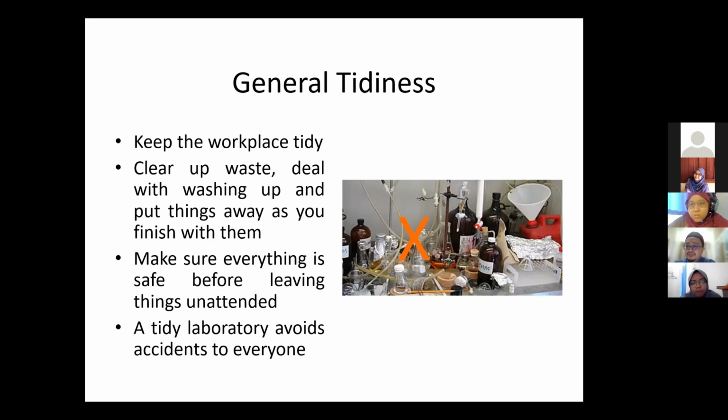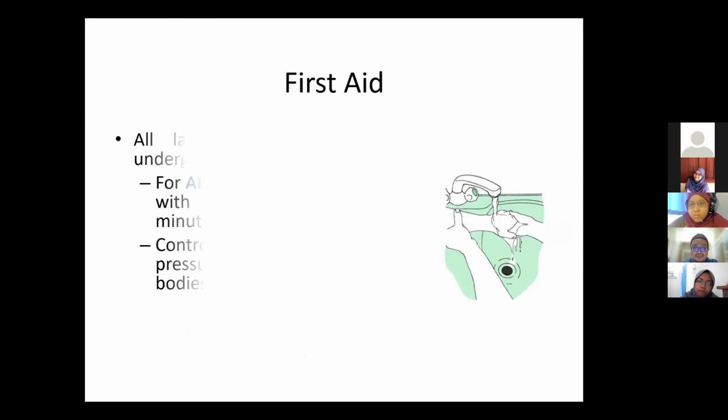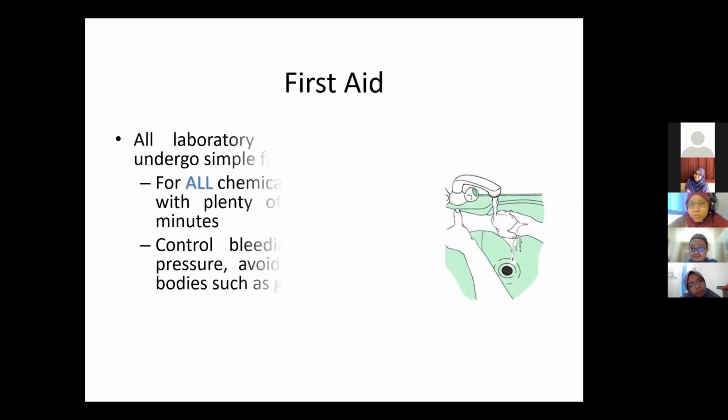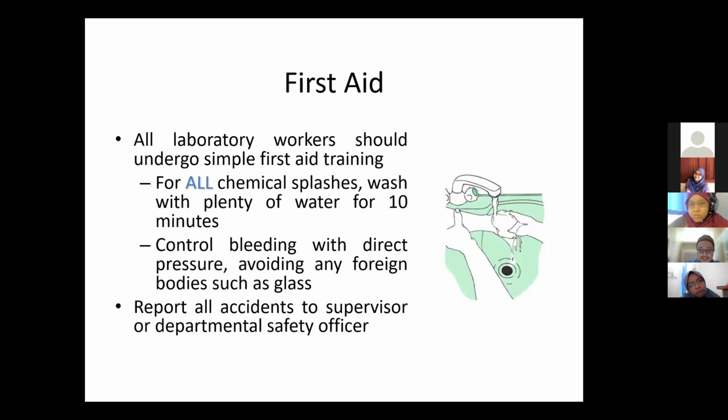Okay, lab equipment. Never use any lab equipment until having received training and having been authorized to do so. Okay, first aid, you need to know some first aid. If you have the opportunity to take first aid training, please take it. Very useful to attend to chemical splashes, bleeding, etc.